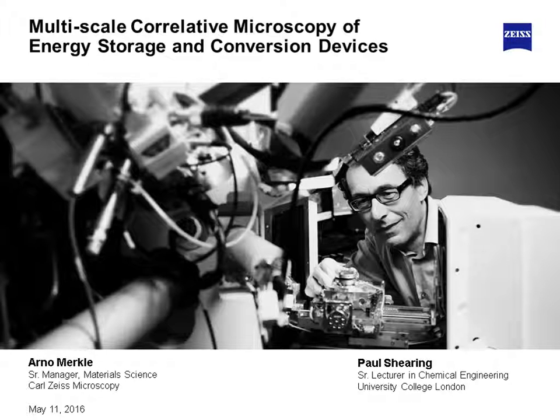As well as the absorption contrast, we also have what we call phase contrast imaging capabilities, both in the Versa and the Ultra, where we have a propagation phase contrast and a Zernike phase contrast mechanism, respectively, which enables us to isolate even very low density materials based on the interaction with the X-rays and the phase shift that's caused by those materials. So there are a bunch of different tricks that we can play, and by combining the different images, we see this as a very powerful tool for looking at composite materials, including batteries and fuel cells.